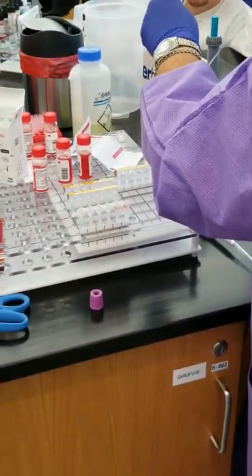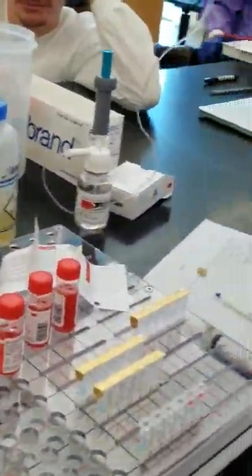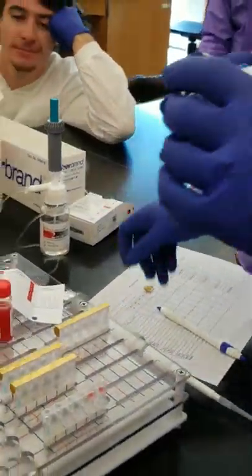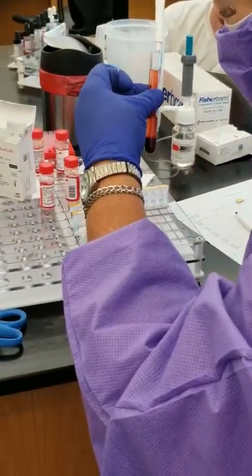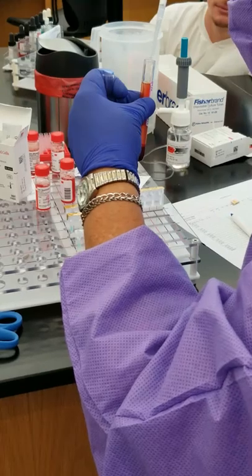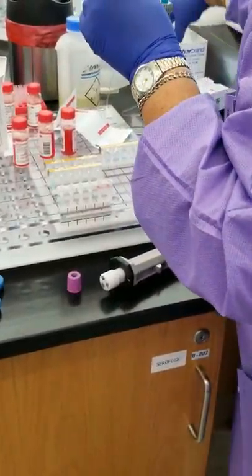What I'm going to make is 0.5 mL. Okay, I'm going to go down into my cells. You're right, it's going to overflow. Mm-hmm. All right, backup plan.